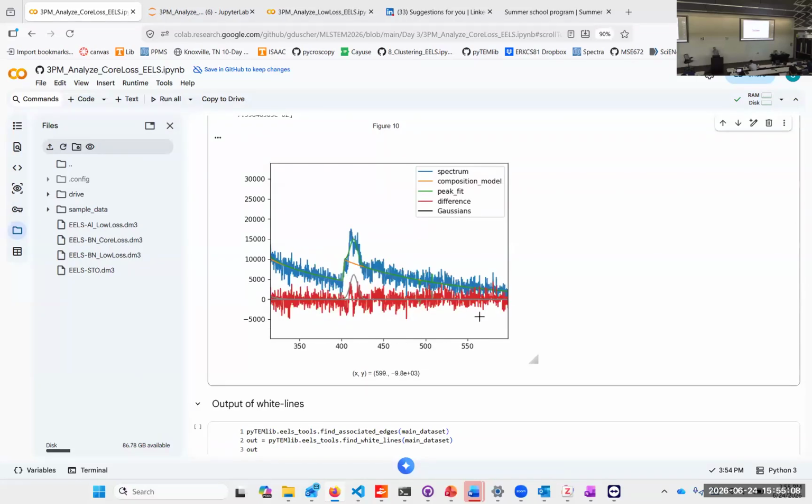So nitrogen is very, very nicely resolved. And you can see that the signal background, signal noise ratio is in the order of 5. And so that is obviously very little. So the nice thing about that is you have now a very nice representation, and one could make it a little bit nicer than that. Here we have this green one.